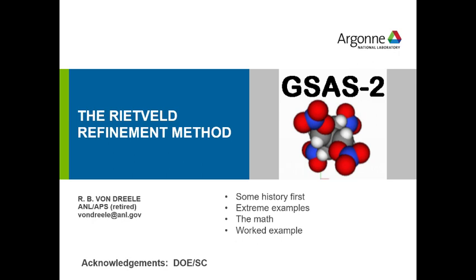And this is an example that's been around for 40 years or so, maybe even close to 50. So it has a long, illustrious history behind this particular sample. So without any further ado, let's get it to go.